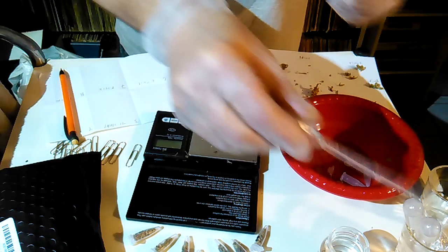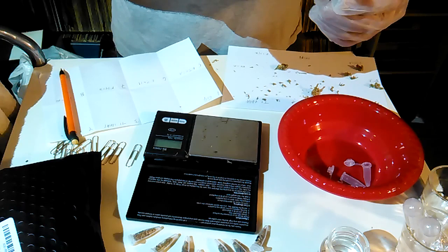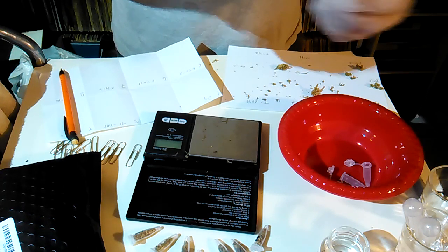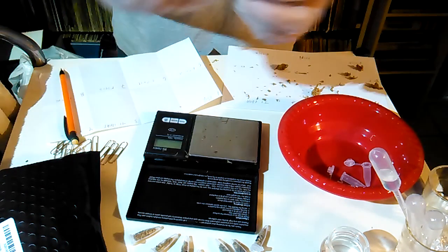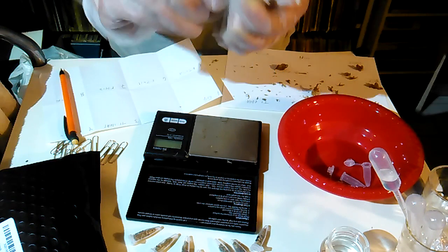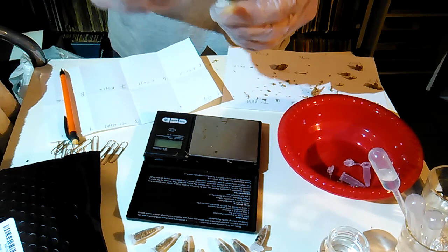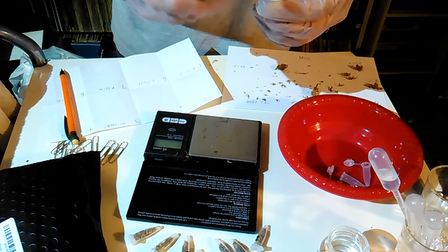This is a 1 ml dropper. I just drip it in basically by eye till it reaches close to the top. So that one got clogged, because it's stuffed in there, so I'm going to use this paper clip to sort of stir it and break it up, and then drip more in there until I can get it close to the top.